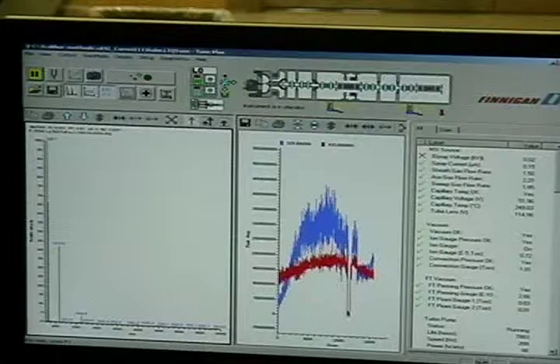Yeah, because when you're in the water part of the gradient, you need to be up here. When you're in the organic, if you're serious about sensitivity, what I actually do is break my gradient into 3 pieces. I step down the voltage. So usually for me this is like 1.8, 1.7, 1.5.